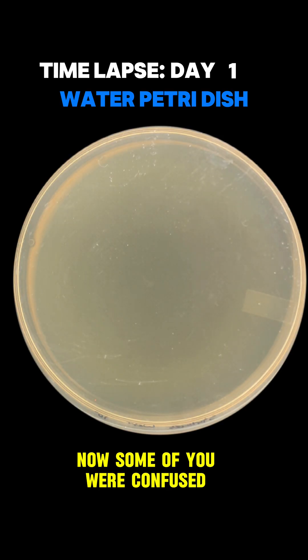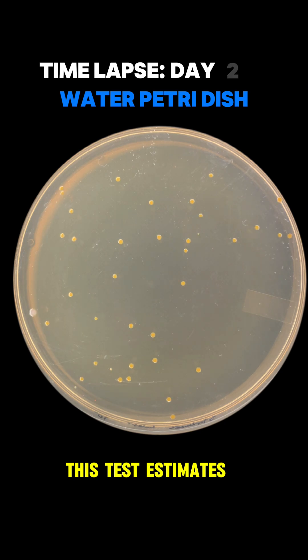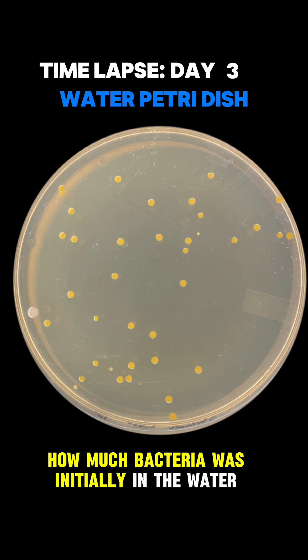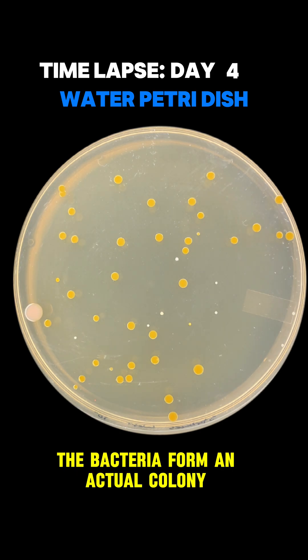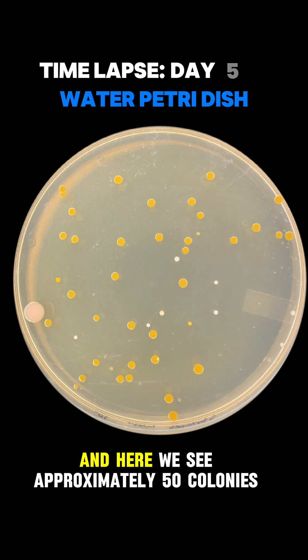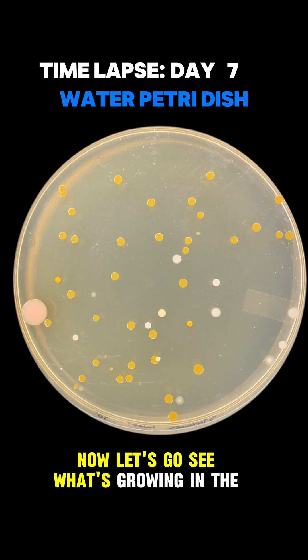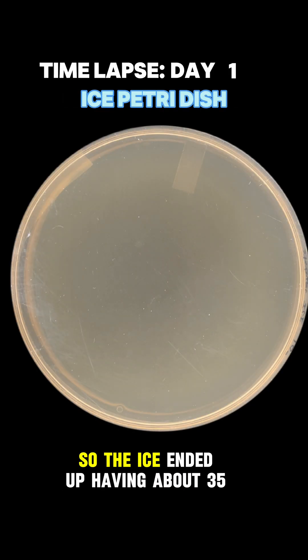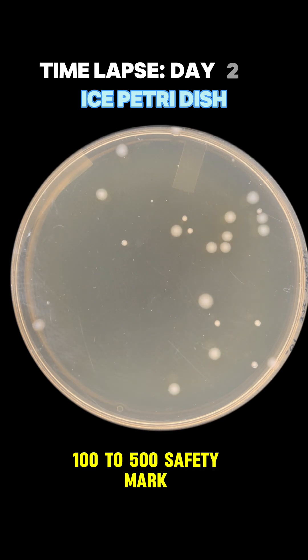Now some of you are confused about what these timelapses are actually showing. This test estimates how much bacteria was initially in the water — it just takes a couple days to see the bacteria form an actual colony. Each colony is made up of millions of bacteria. Here we see approximately 50 colonies on the water dish, which is well below the 100 to 500 safety mark. The ice ended up having about 35 colonies, also well below the safety mark.